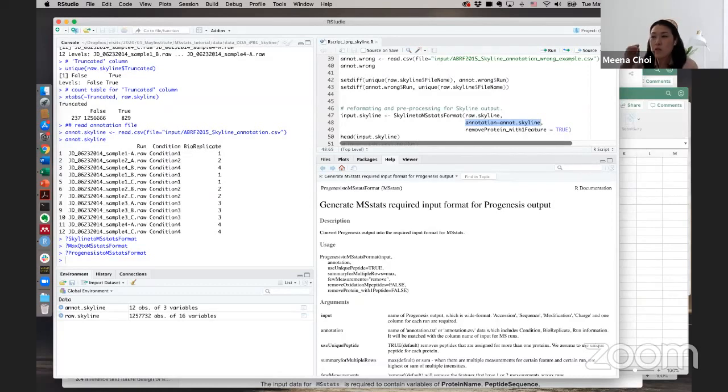Importing the data: Q value cutoff, default true. What does the Q value mean? This is only for DIA cases, where the processing tool reports values based on its FDR. Some tools call this the M score, other tools call it a Q score or something else. How it is calculated is really specific to the tool's algorithms.